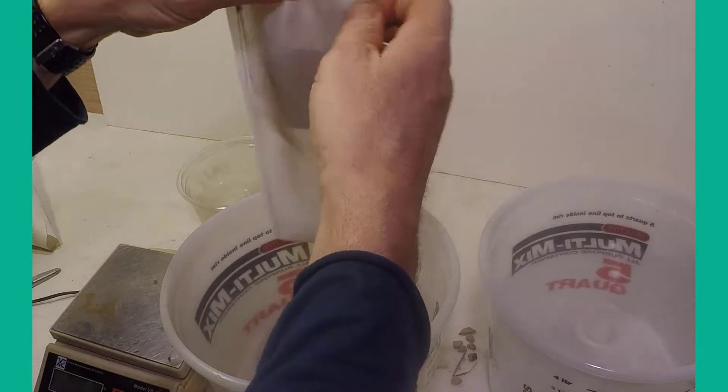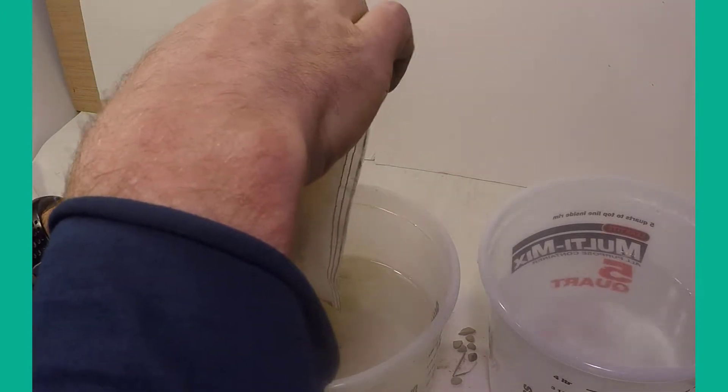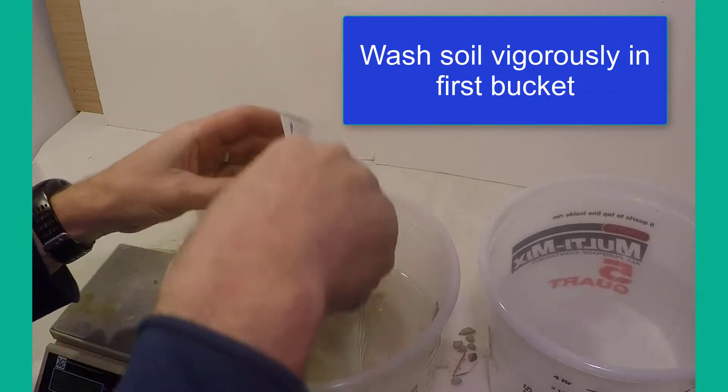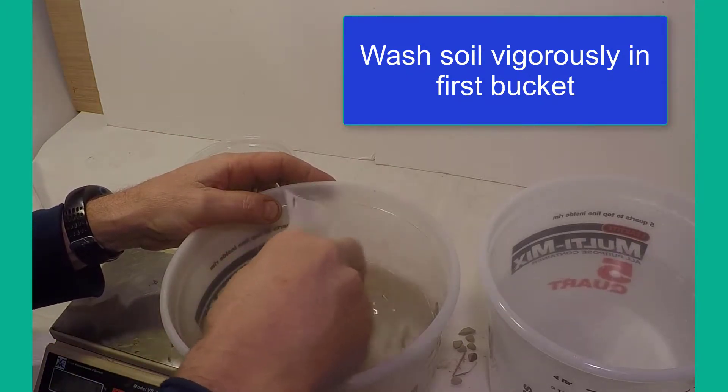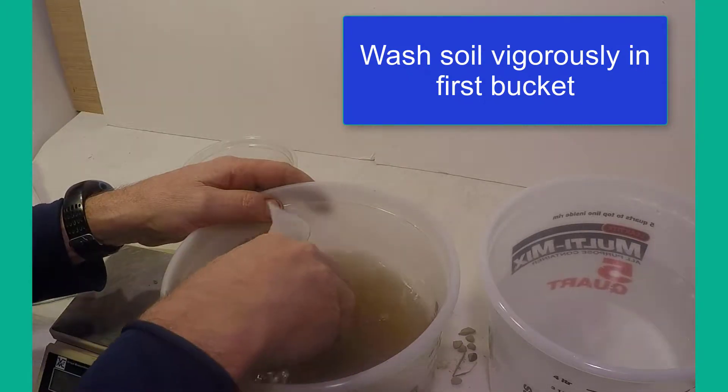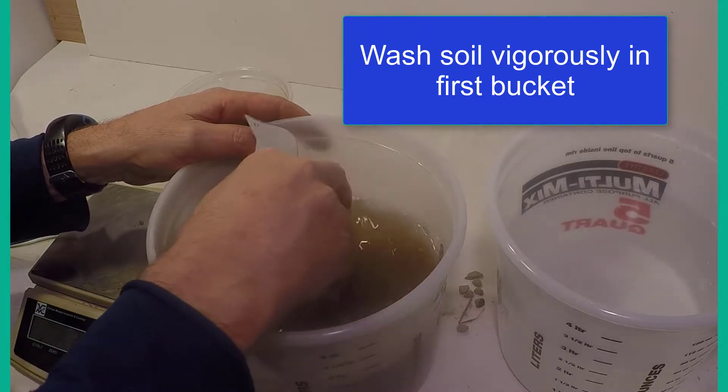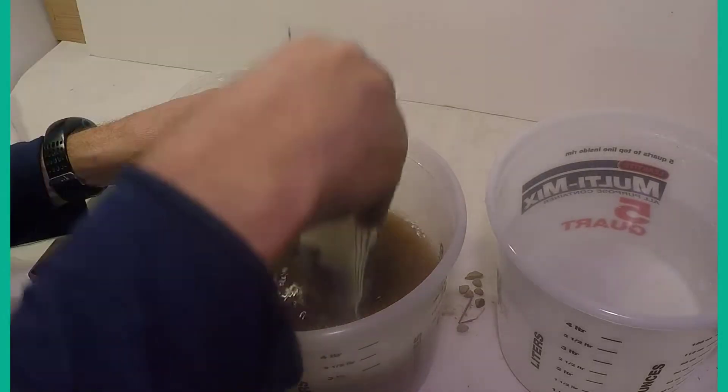Next, the soil is washed vigorously in the first bucket until only small stones and large residues are left in the sieve bottle, and some smaller residues and sand are left in the mesh bag. This may take a few minutes.